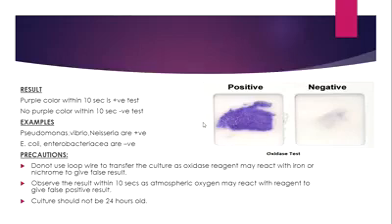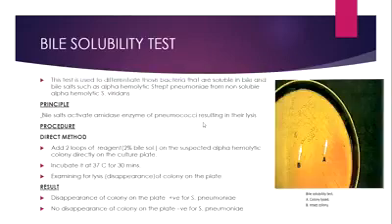We have to observe the result within 10 seconds, because if we prolong it, the atmospheric oxygen may react with the reagent and also give false positive results. And the culture should not be 24 hours old.